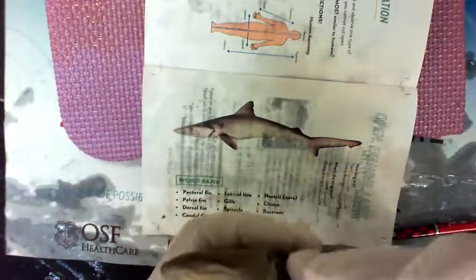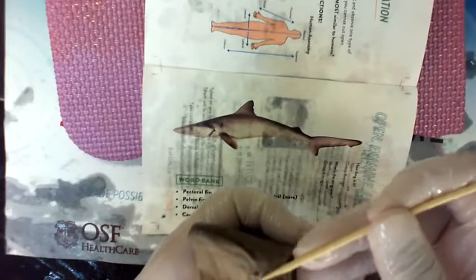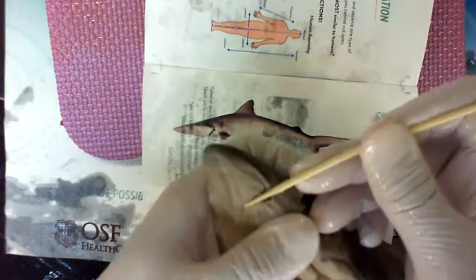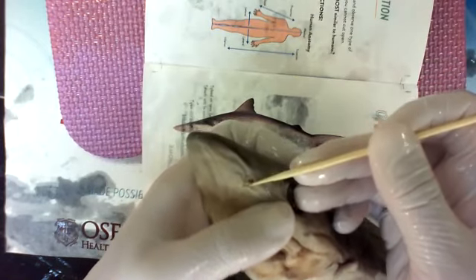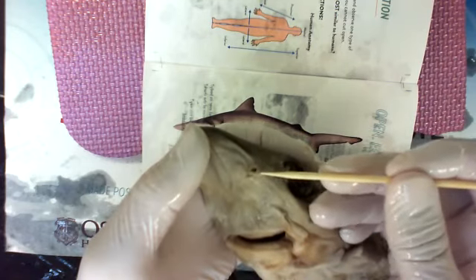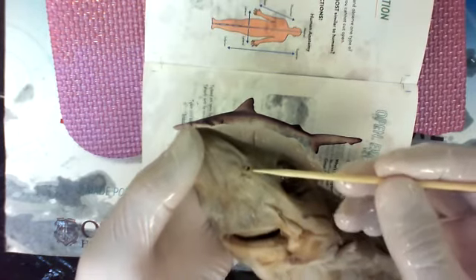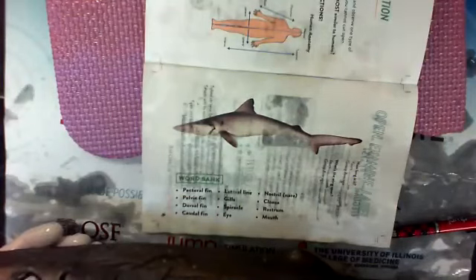If you look in there, you can kind of open it up a little bit and take a peek in. My camera is not the best, so it gets a little blurry, but these are blind openings, not because they're for vision, but because they don't go anywhere. It's just a hole. Whatever comes in here stays in here and then gets squirted back out. It's not like us where you put something in your nose, it goes to the back of your airway and down. These are blind-ended. They're only there for smell. The end. And they're called nares.